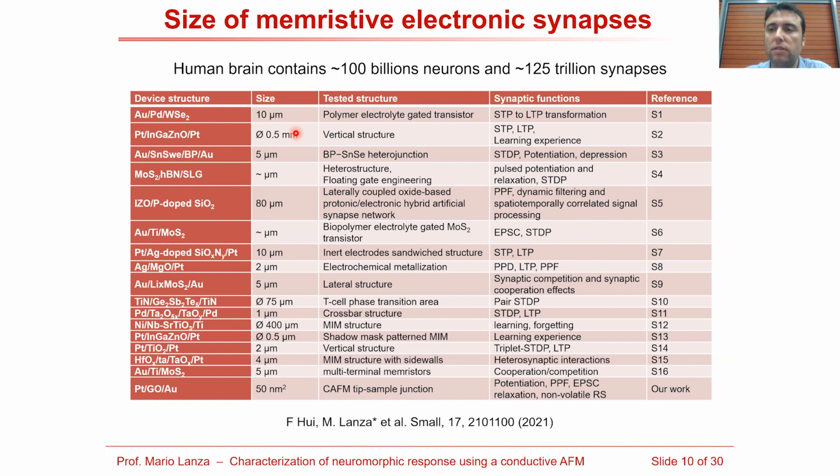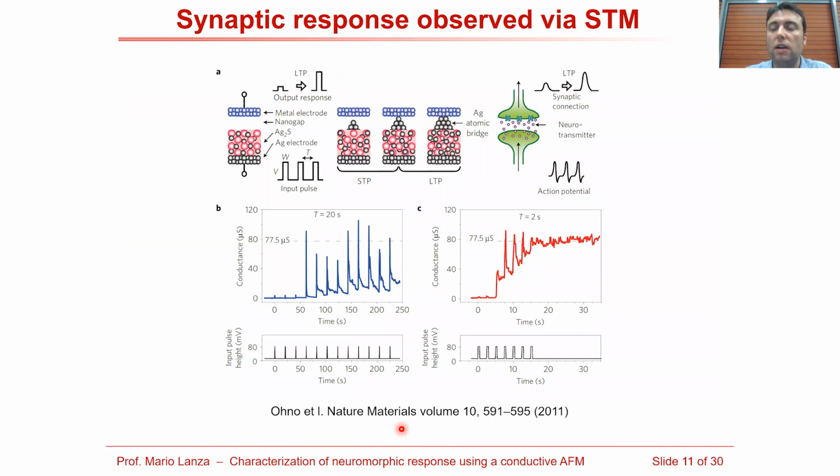So what we are trying to do is to explore synaptic response at the nanoscale, which is what we do in our recent paper, which this presentation is going to be focused on. One possibility that has been used in the past is to use a scanning tunneling microscope in order to explore nanosynaptic response at different locations of materials.